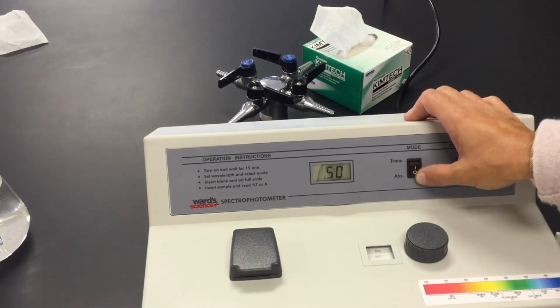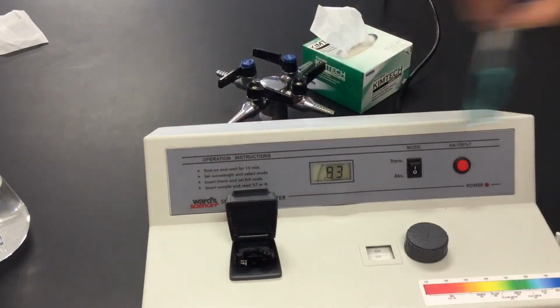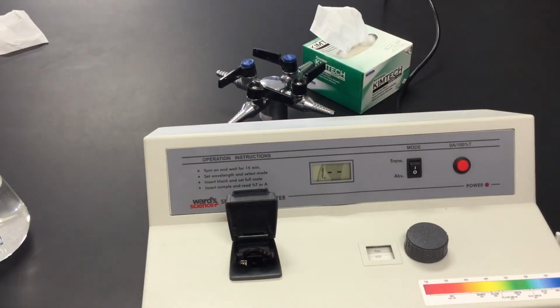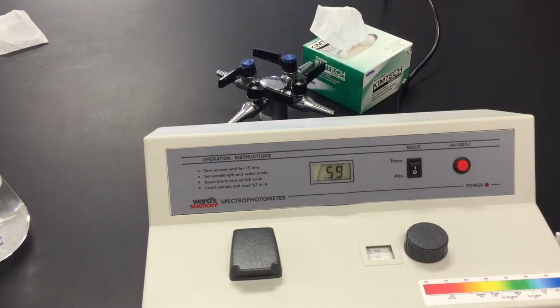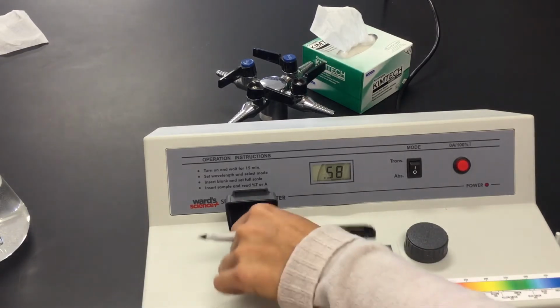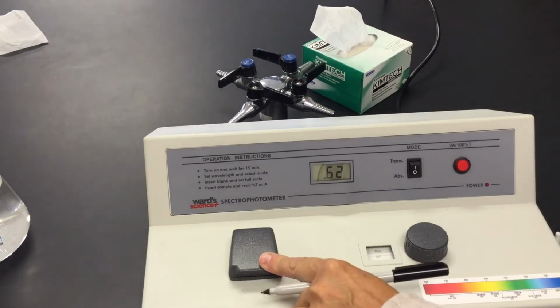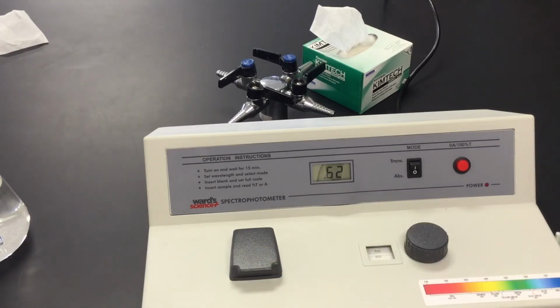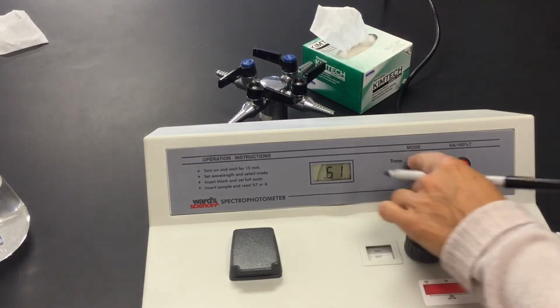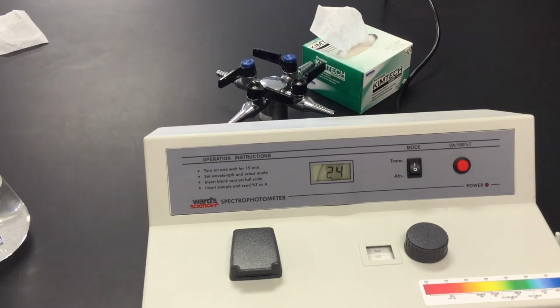Going back to absorption, going back to my next tube. So we're now up to tube number 8. Tube 8 goes in. Tube 8 is 0.7 molarity. Our absorption is 0.59. I can pull out this sample of copper sulfate. I'm sorry, let's find our transmittance. So we'll switch that to 0.62. So for sample number 8, change your absorption to 0.62. Transmittance is 24%.